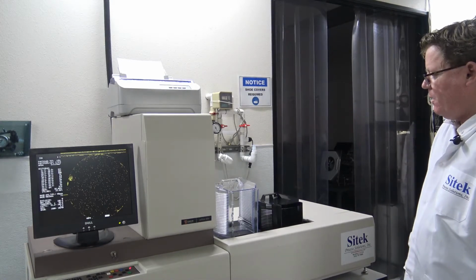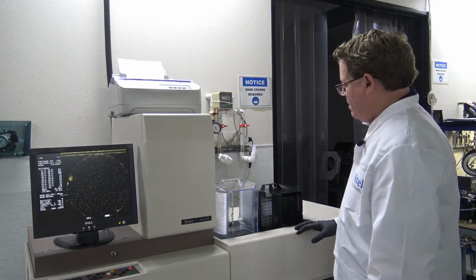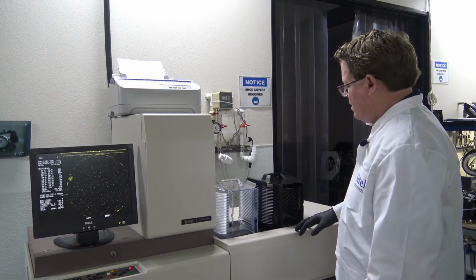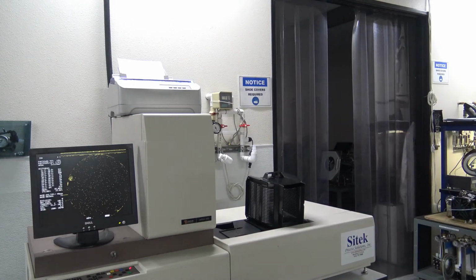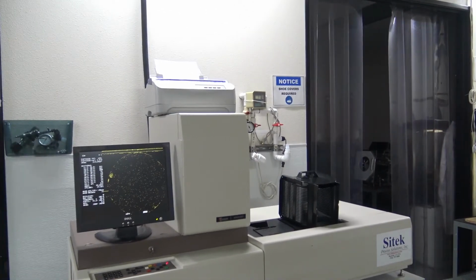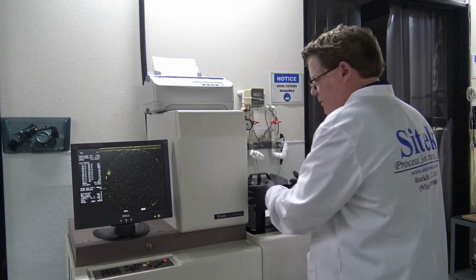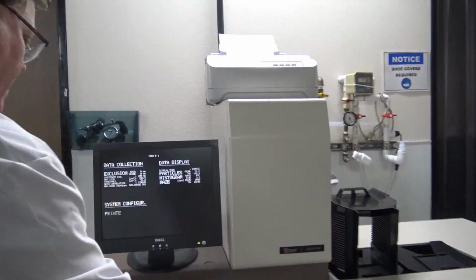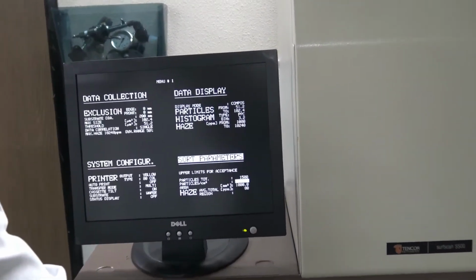Alrighty. What I'll do now is I'll go into the single wafer mode, the single transfer mode. So I will remove this cassette. I'll move over now to the send elevator. So now in the program, I get back in the program here. The next key moves you to different quadrants.